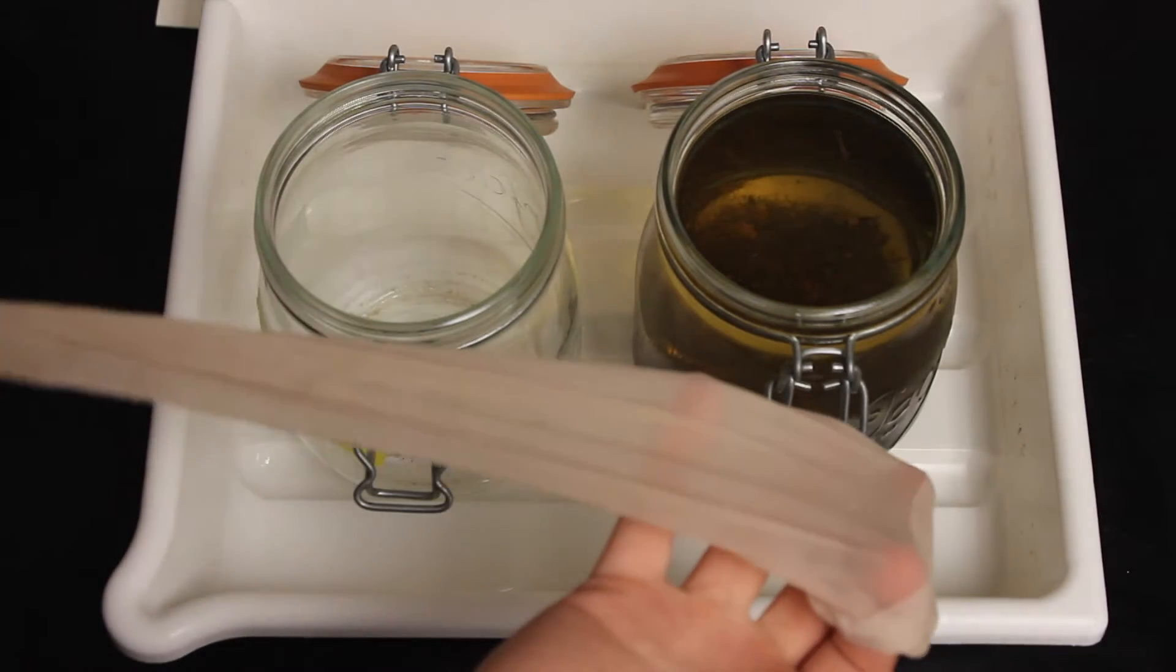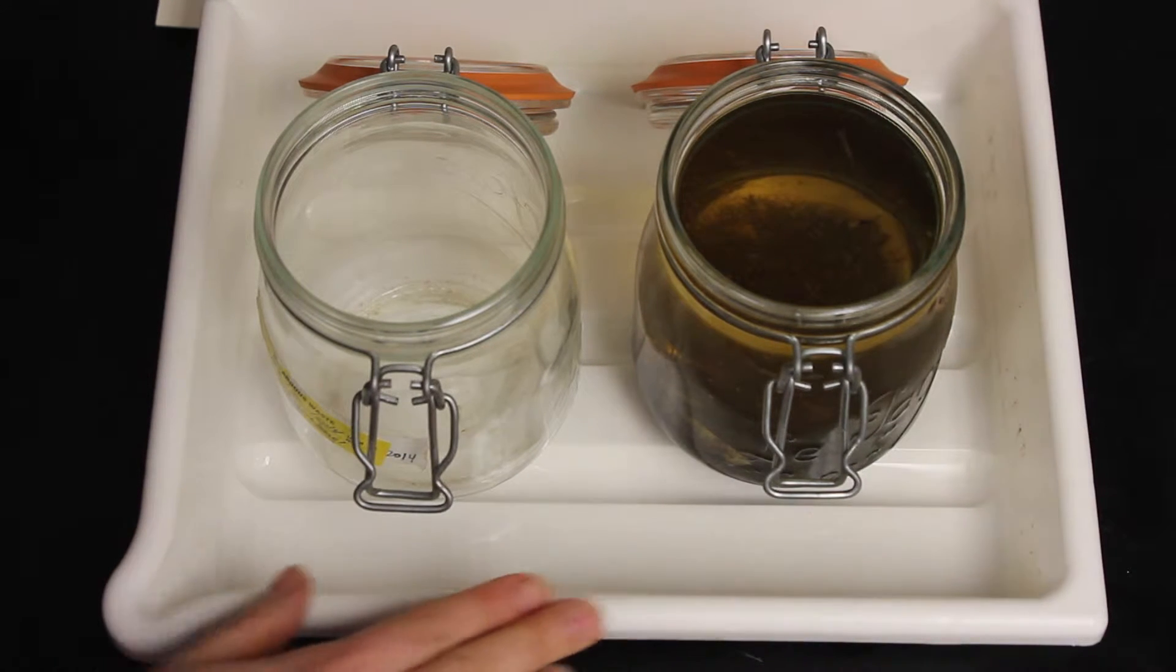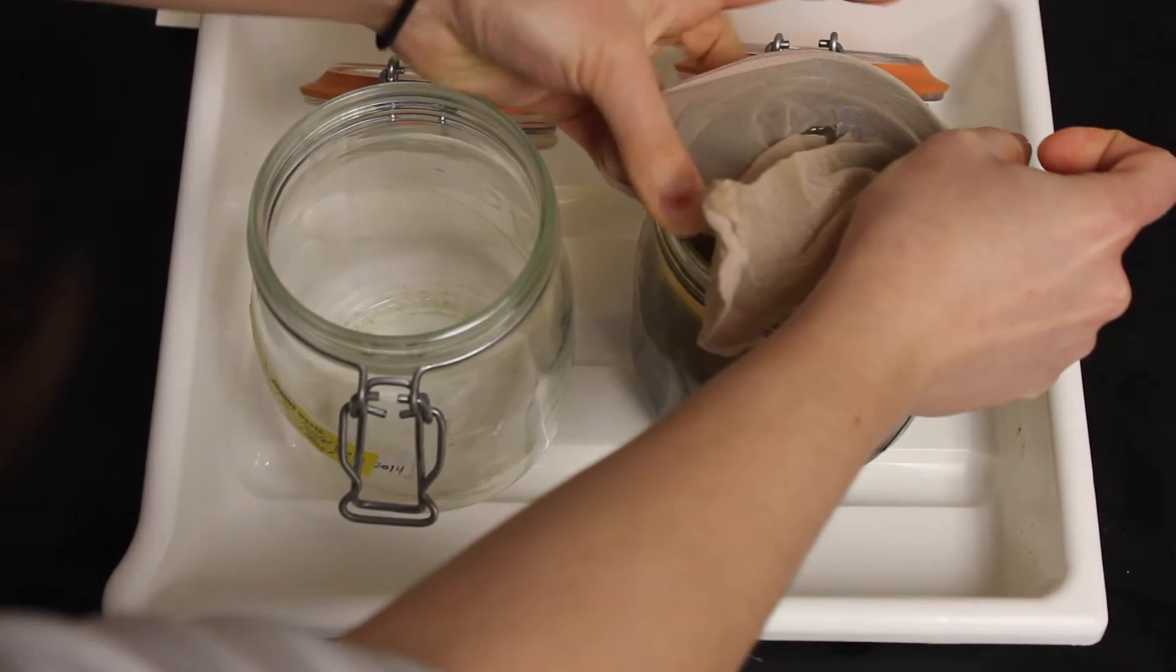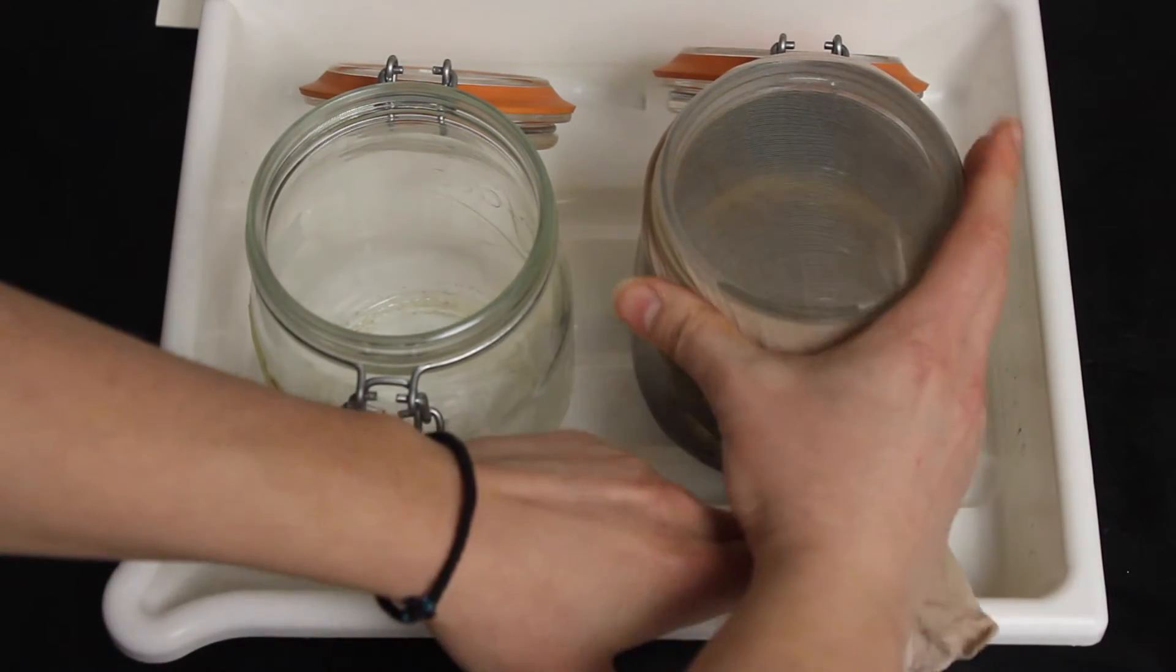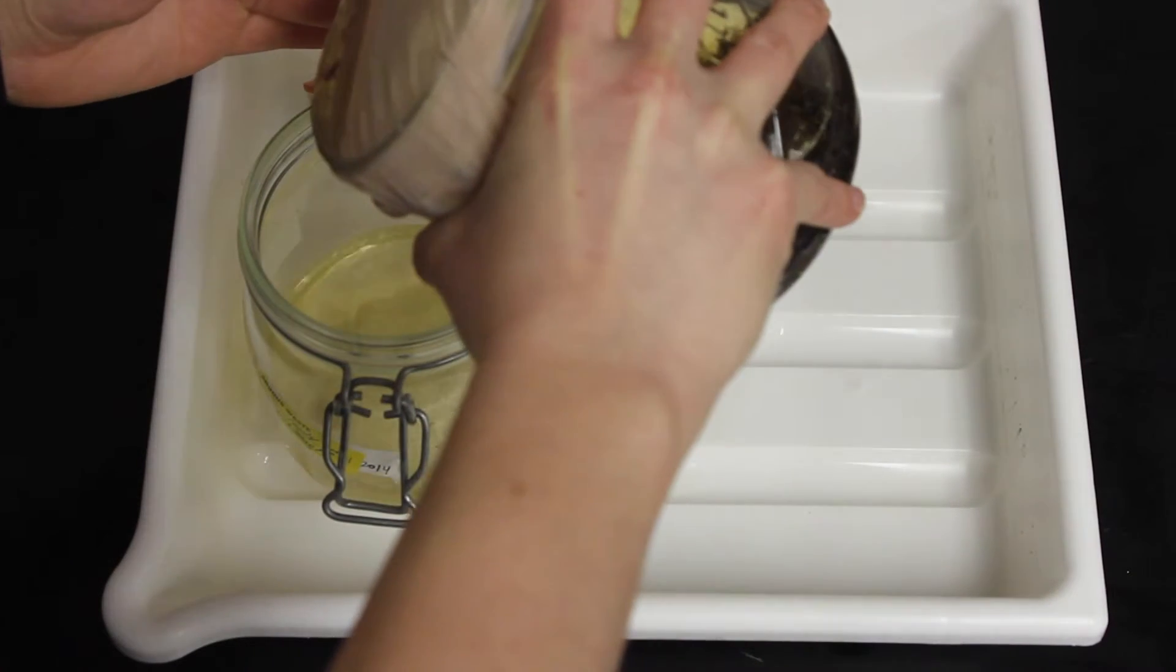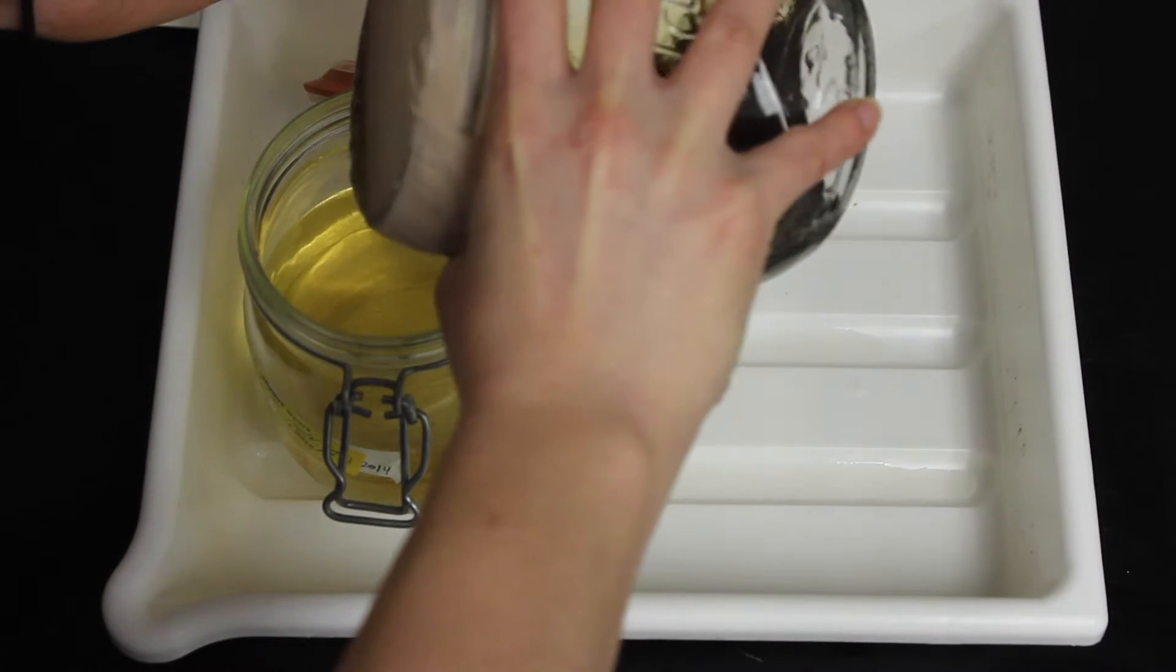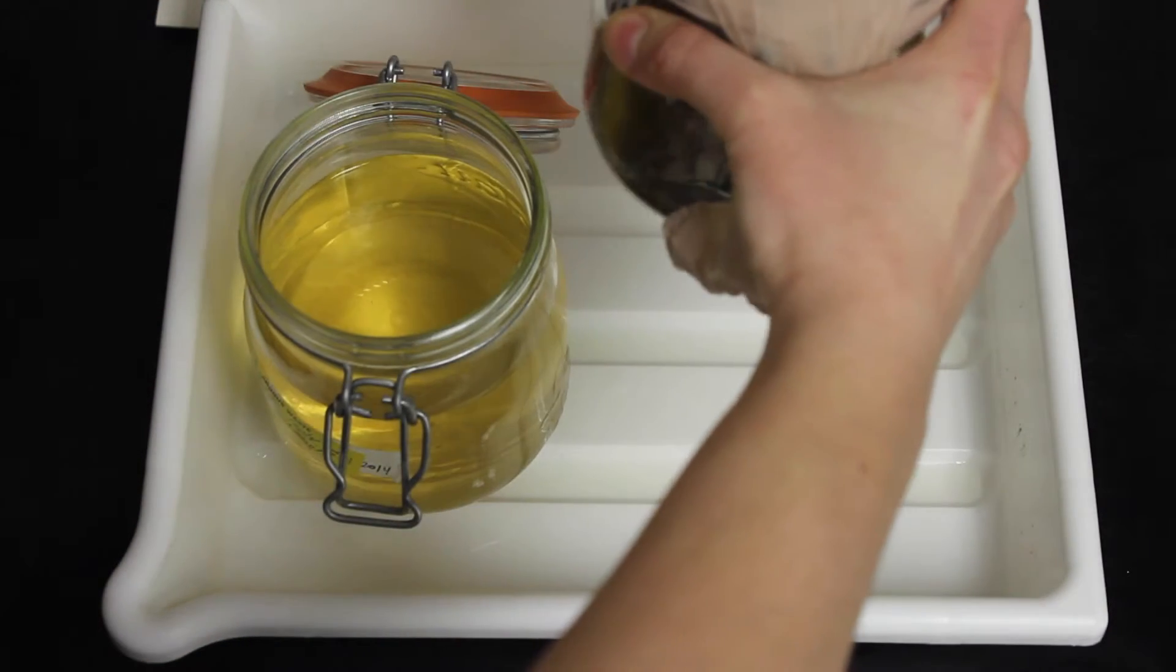And we use pantyhose to make sure that none of our specimen escape. Additionally, we're going to place them inside our large sorting tray so we don't make a mess just in case the ethanol spills. So first, we're going to place the pantyhose over the lip of the jar. Making sure that it's nice and tight across. Just like this. Then, we're going to pour it inside our waste jar. Get a little bit more. That's a good enough amount.